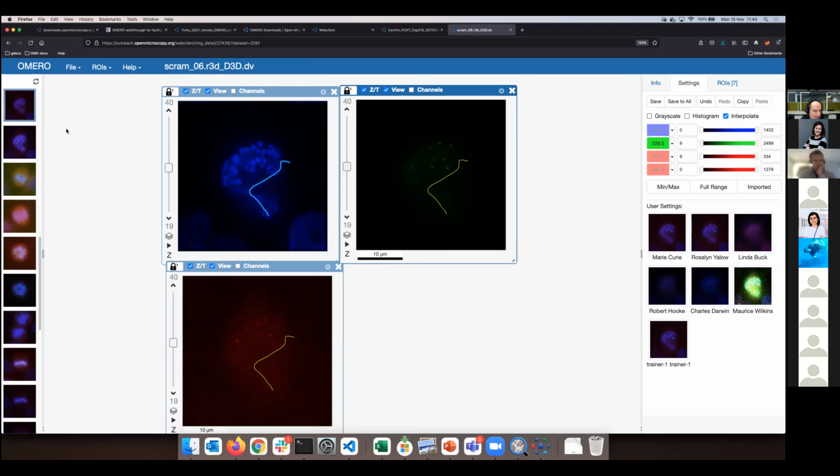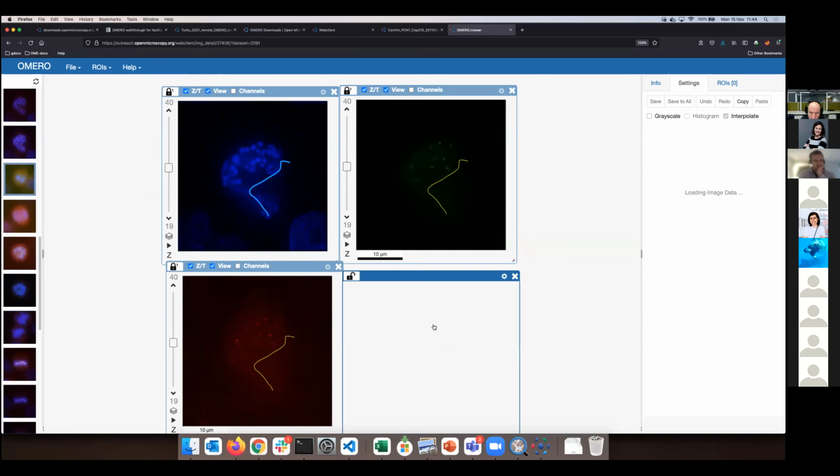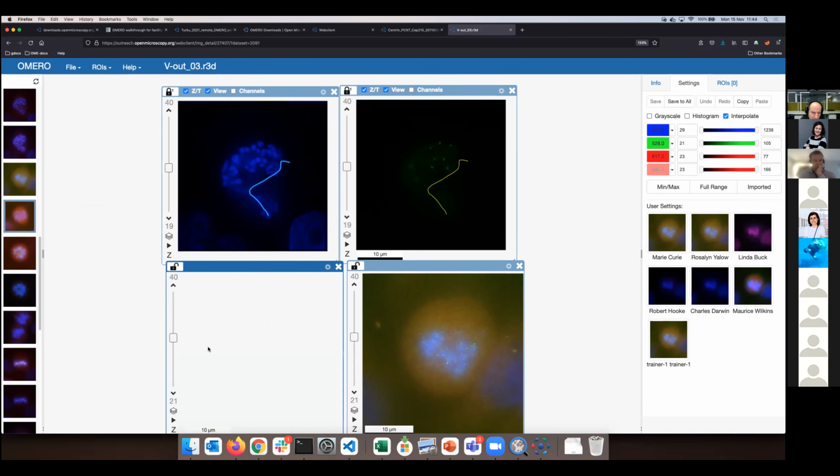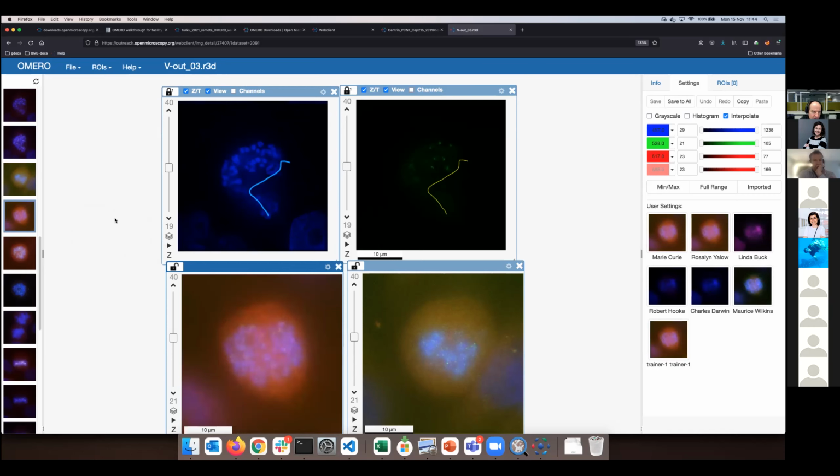So once more, to understand the multi-view, it's documented, but sometimes it's hard to. So there are two modes. So you can drag and drop to a new pristine place, so to say, and this will open a new viewer, just like I did with a new image. Okay, or you can drag and drop the same image as I just did. You can drag and drop into an existing viewer, like so, and then it will replace the image in the existing viewer with the one which you just dragged and dropped there.